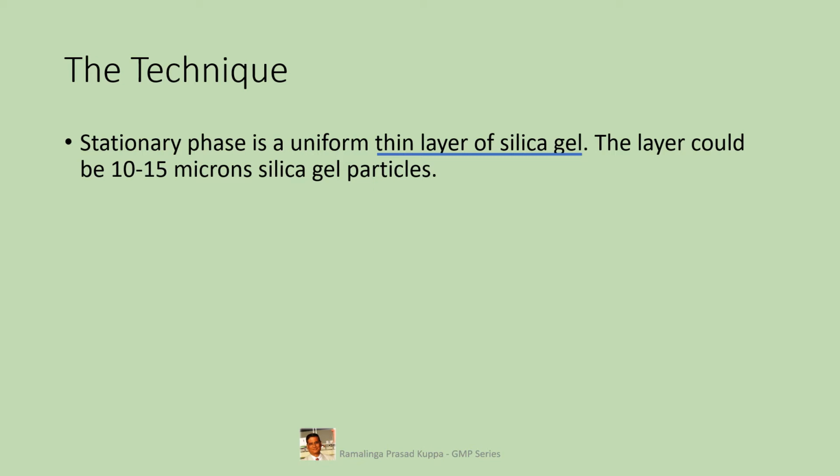Silica gel GF254 is a common stationary phase used for testing. They are more uniform and easier to handle for routine testing. Do you know the meaning of GF254?